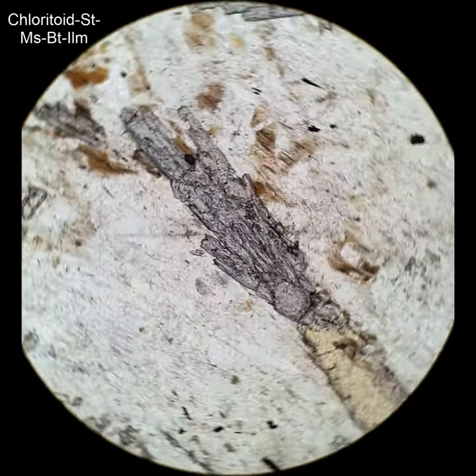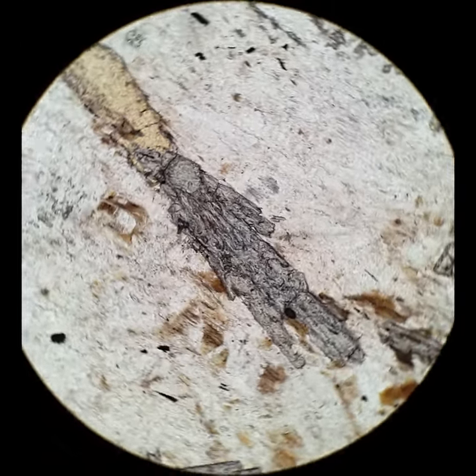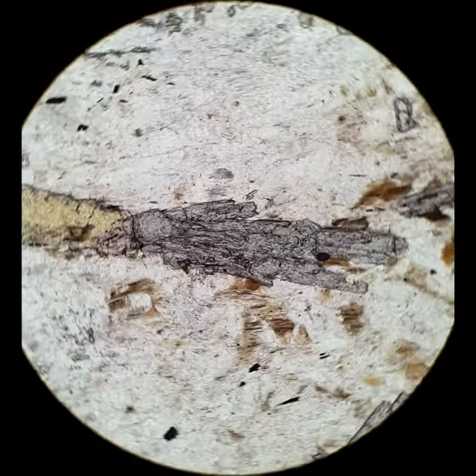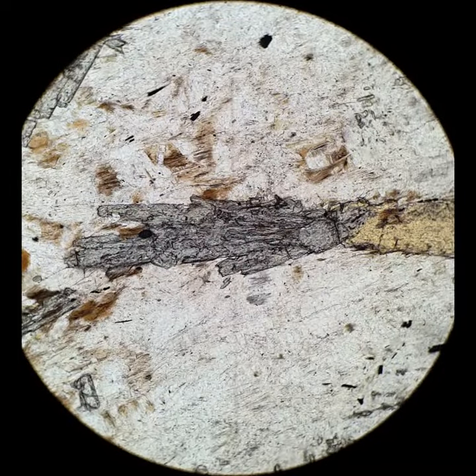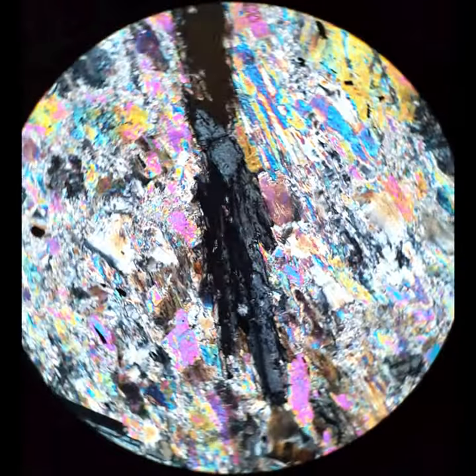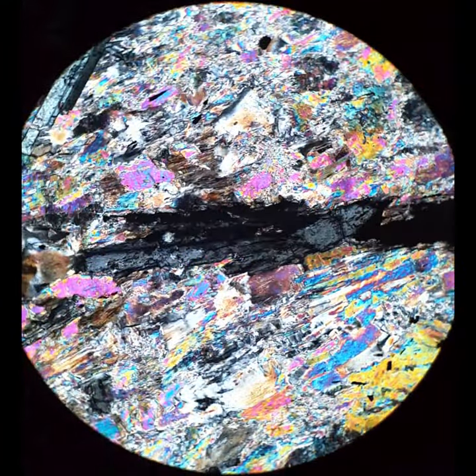Here I wanted to compare chloritoid, which is in the center, with staurolite, which is coming around to the top — the yellow crystal. They have virtually identical relief and are often found together in the same rock. What is particularly distinctive is that one is blue and the other is yellow. Otherwise they're kind of similar in texture, although staurolite generally doesn't have the twins that chloritoid shows.